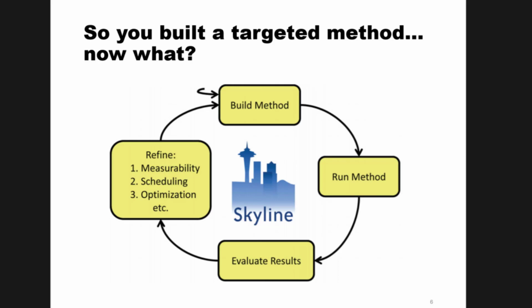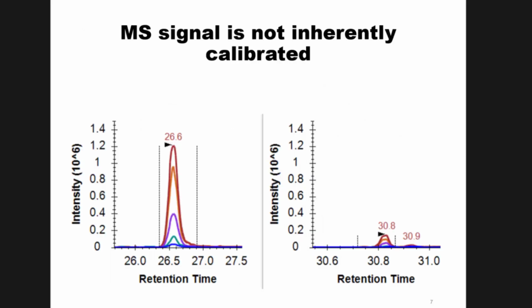You evaluated those chromatograms. You removed any interferences. You built an IRT calculator. And then you just keep doing this, refining your method, refining your method. This is where it starts to become the step of thinking about calibration and validation.